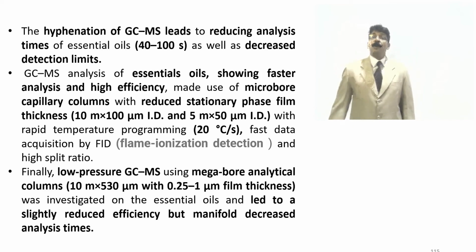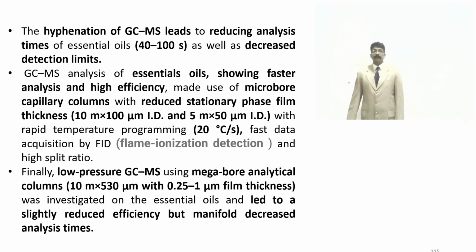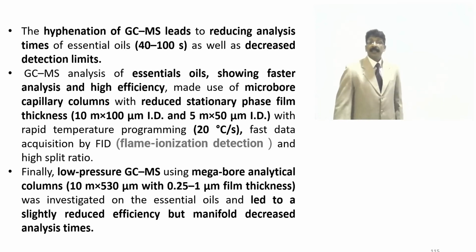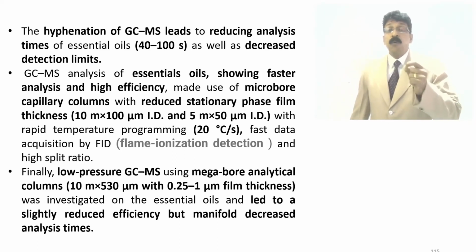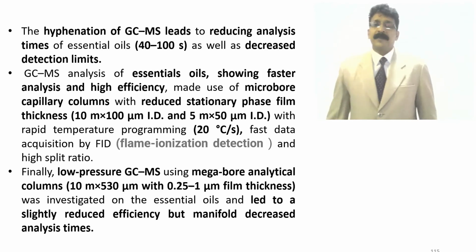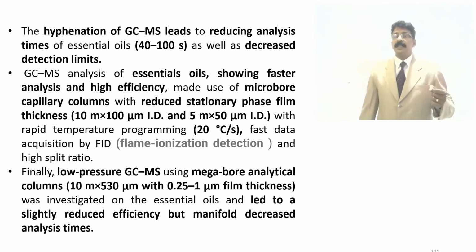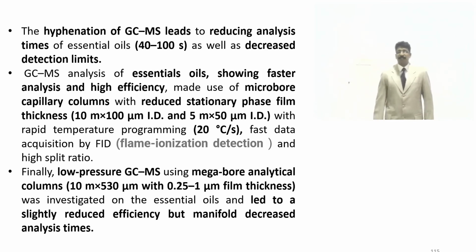This was investigated on essential oil and leads to slightly reduced efficiency but a manifold decrease in analysis time. The main thing is that analysis time is more reduced, and high efficiency results can be obtained by means of GCMS, gas chromatography mass spectroscopy.